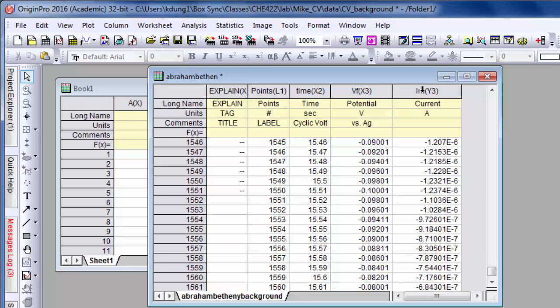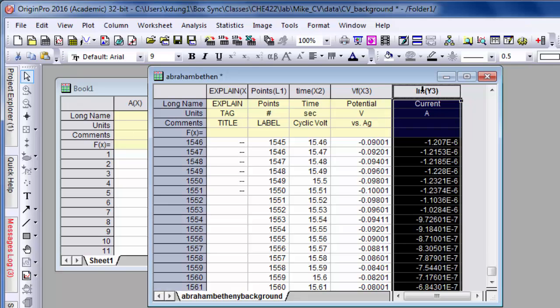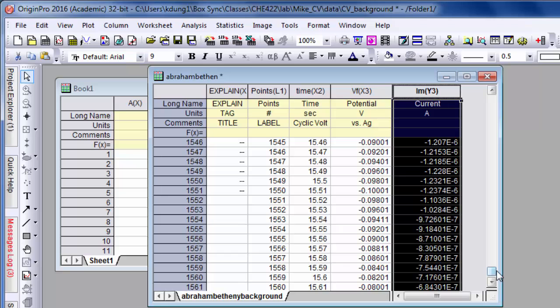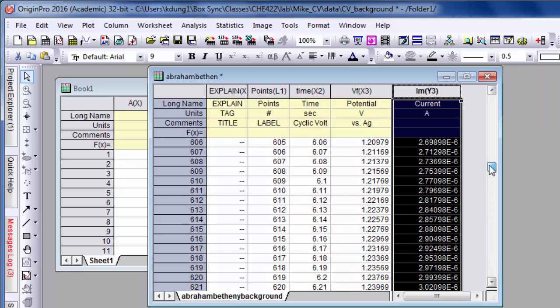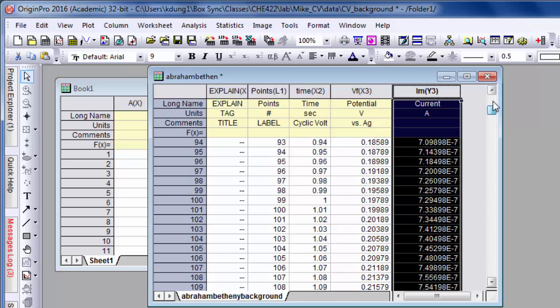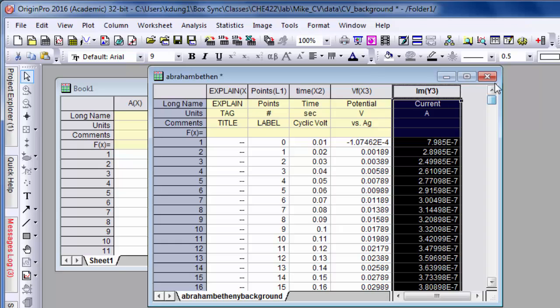Now we can take this Y3 plotted against this X3, the current versus potential, except that the electrochemical program called the oxidation of ferrocene positive current. And by convention, that should be negative. Oxidation should be negative current. So we need to do some math.